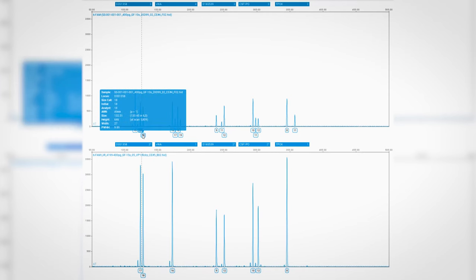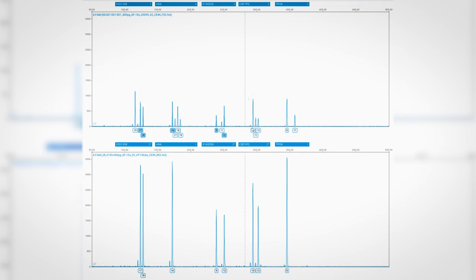Samples that are able to be interpreted can be compared to known DNA profiles from individuals in the case.